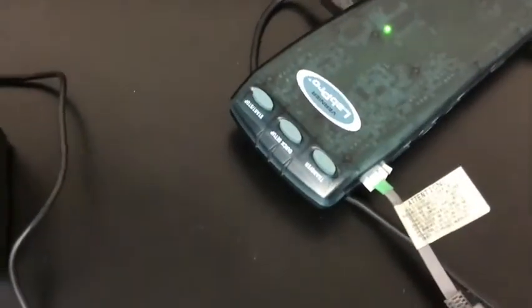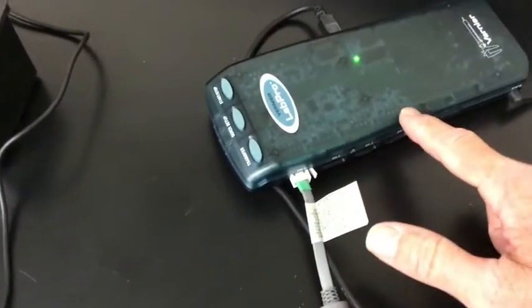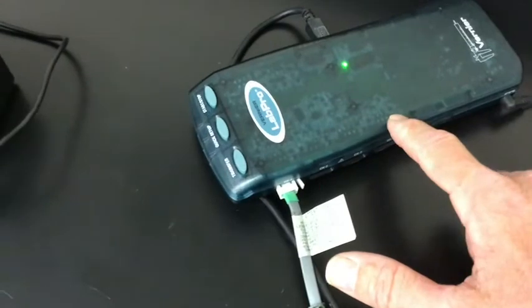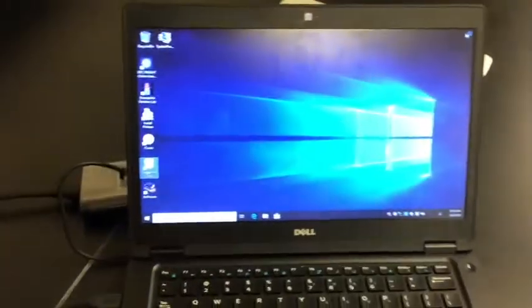So now I have a colorimeter hooked into channel number one. If you were to use a temperature probe or some other type of probe, it doesn't matter which channel it goes into — the computer will recognize it. You just need to keep track of which one it is. So now you've got a device hooked into the green box, which is then hooked into a computer with power.